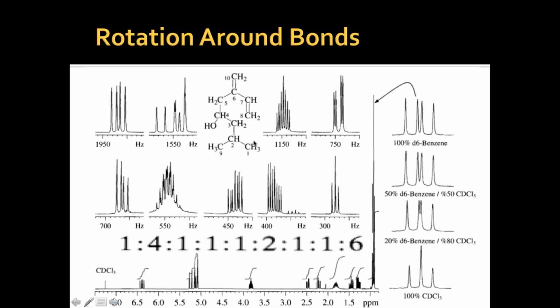Now you have the double bond, you have that single bond. The double bond, of course, will show, right? All the single bonds are below that. Now, a big peak at one point something. The huge long peak is these. They are in the influence of one CH. Both are in the influence of CH.